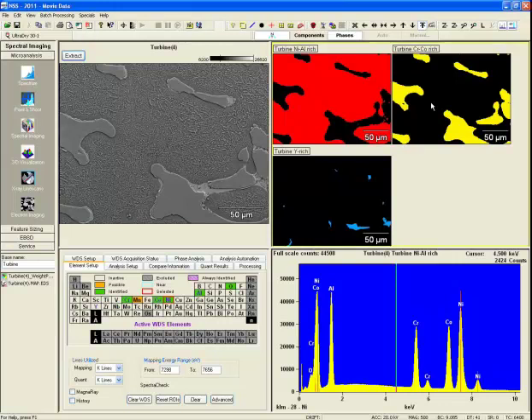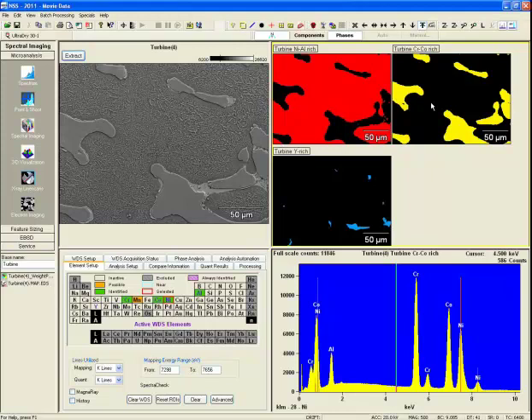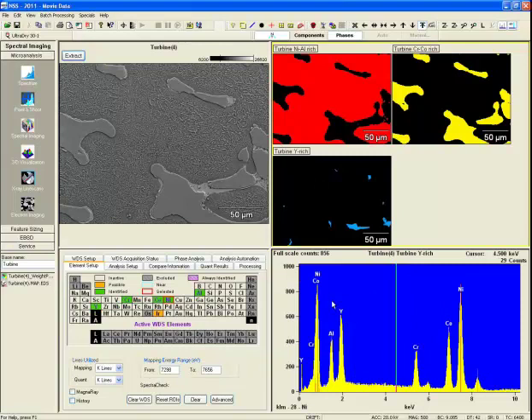The globs are the yellow maps that are now classified as chromium cobalt because that is the spectrum that it best matched for the labeling purposes, and the spectrum that it shows has higher chromium and cobalt compositions. In addition, it found an extra component that we had not seen earlier on, which is classified as the yttrium rich. If I click on that map and show, we can see very clearly there is an yttrium peak in the spectrum with the nickel, cobalt, chromium, and aluminum, but there is now an yttrium-rich phase.